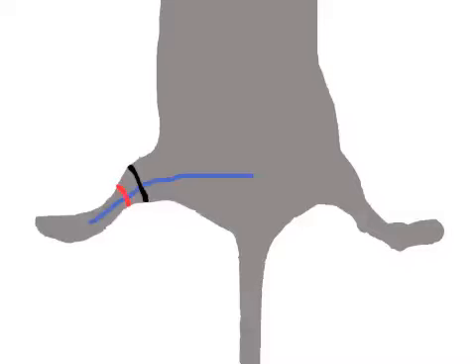The reference electrode, indicated in red, is just placed beneath the sensing electrode.